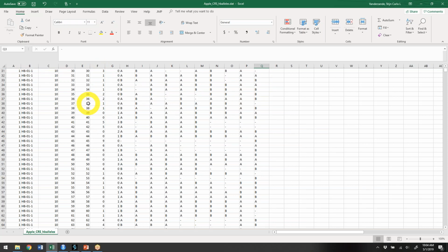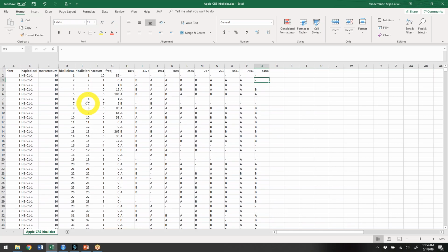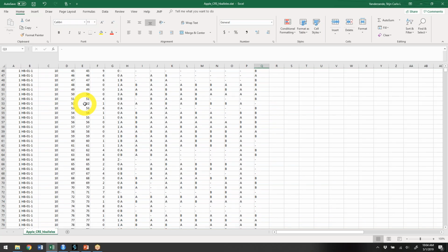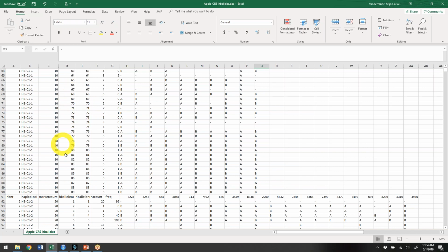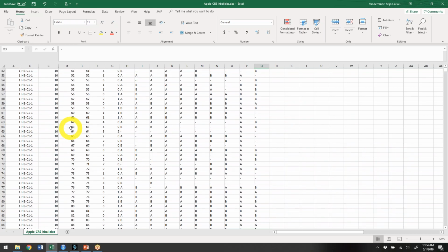You can also see that FlexQTL keeps all the alleles PetTy haplotyper wants defined, even if it was able to consolidate them after that. So in the whole process of this, PetTy haplotyper will define 89 alleles for haploblock 1. And the more SNPs there are in a haplotype, most of the time the more haplotypes it will have defined.